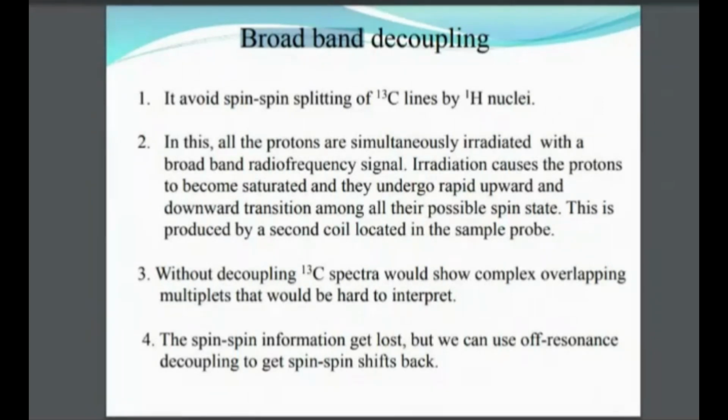So when this is happening, because the absorption is quantized, this range of spectrum is not suitable for C13. So they will remain at the ground state. I hope you can imagine this. So if the flipping of H1 has already occurred and they have gone to the higher energy state, they will not couple with C13.